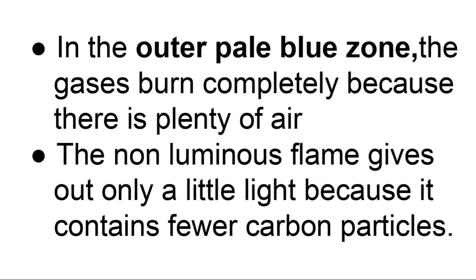Then we have the outer pale blue zone, in which the gases burn completely because there is plenty of air. And I believe you can see the location of the pale blue zone. Out there it is in contact with air, and therefore complete combustion leads to the production of the pale blue zone. The non-luminous flame gives out only a little light because it contains fewer carbon particles.